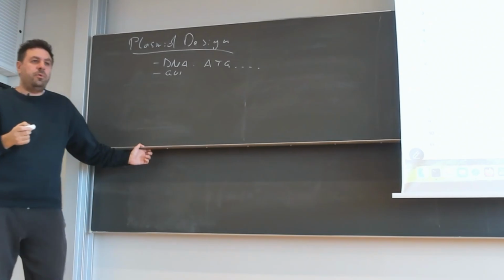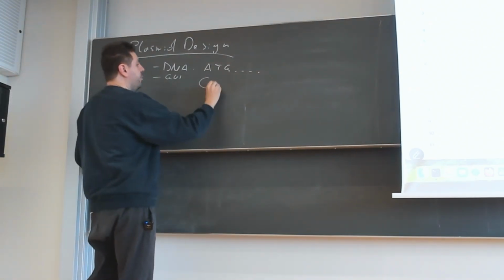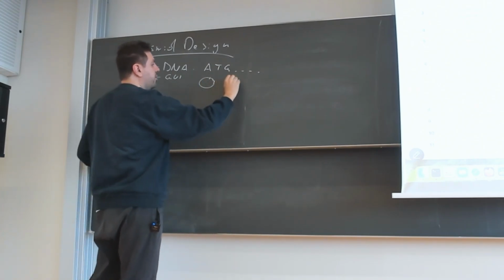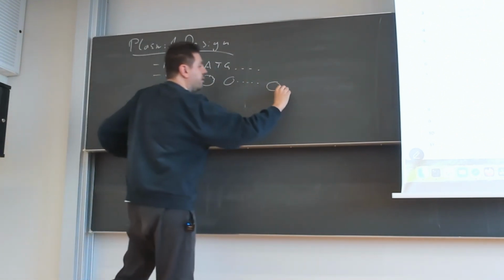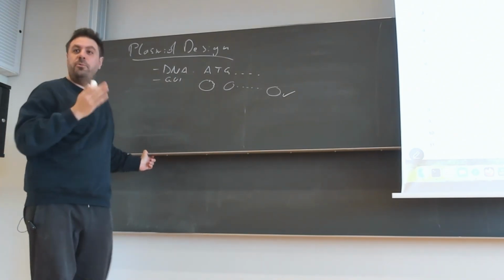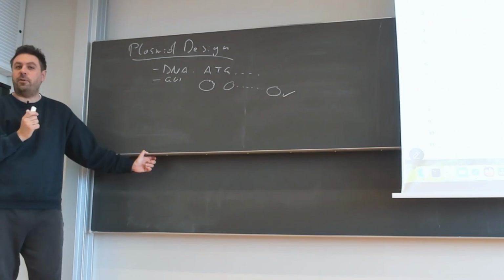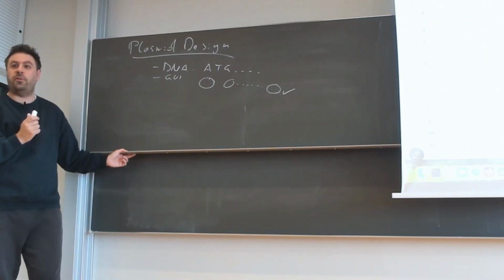You're creating your plasmid by selecting this part here, then copying it there, and so on, and in the end you have what you want. And this is the DNA string that you're going to synthesize or use, and you put it into the bacteria.